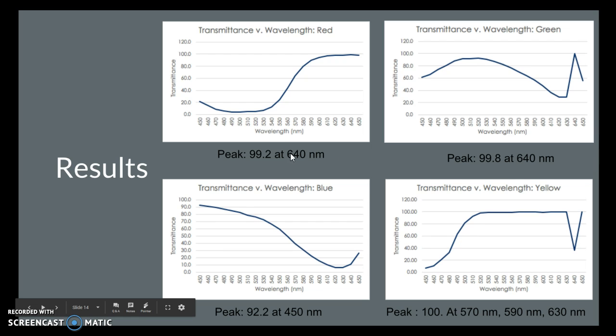So at 640 nanometers, that is about the wavelength for red, all of this stuff here was being transmitted through, whereas, like we said before, the percent absorbed is all in the upper end of the energy spectrum, or ultraviolet, greens and such like that.